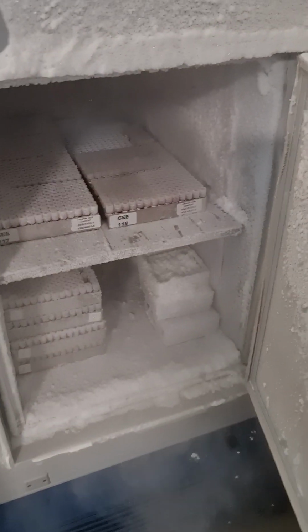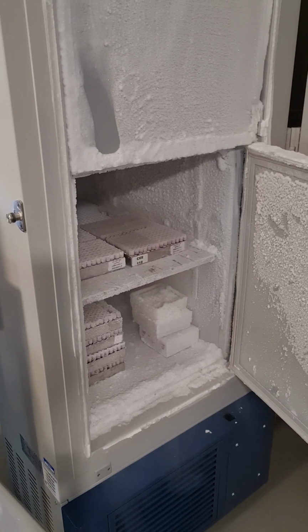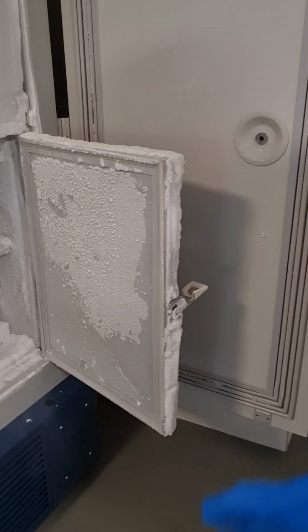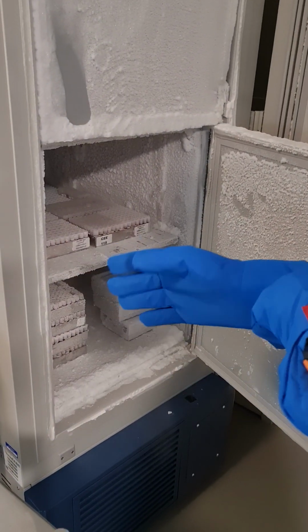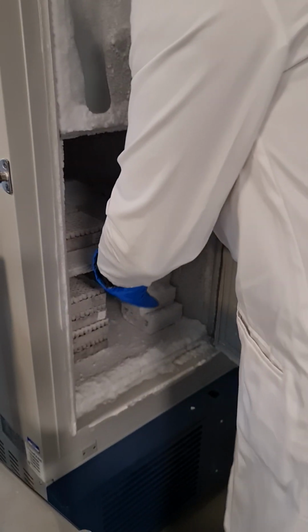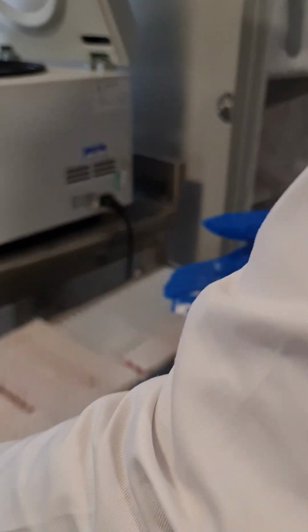So this is our freezer. Look for the corresponding trays. Always safety first. Blue gloves. Pull the tray out safely.